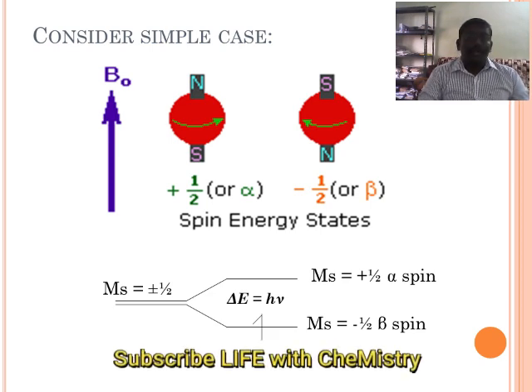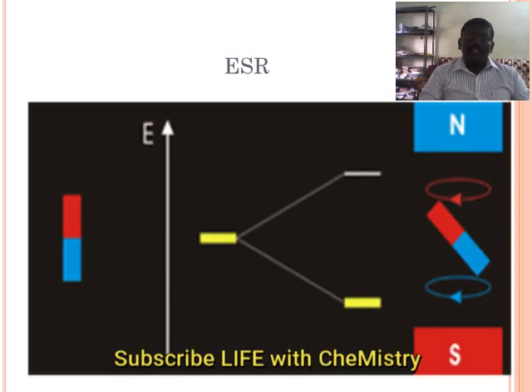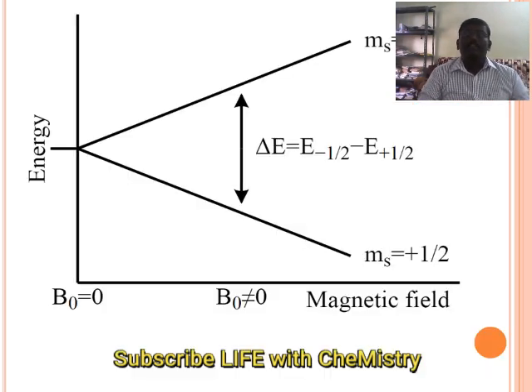Already you know that a radical means an odd electron. So it is mainly involved with transition metals and metal complexes in this spectrum. When an atom or molecular system with an unpaired electron is subjected to a magnetic field, the electron energy levels of the atom or molecule will split into different levels.